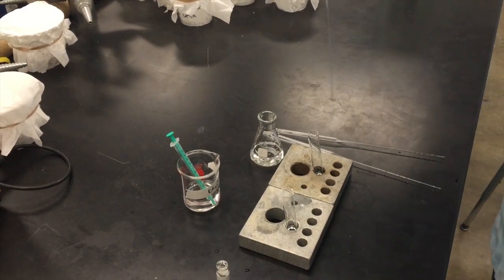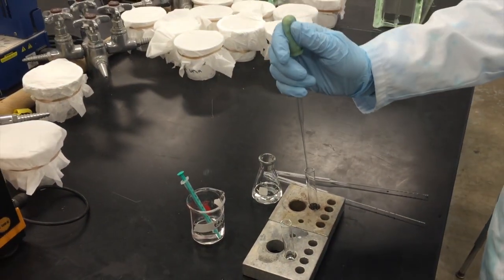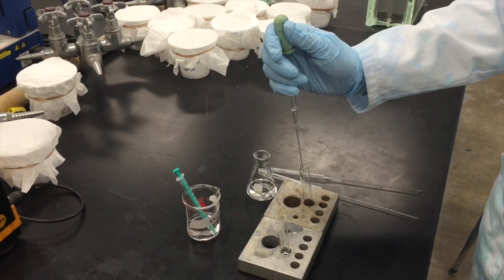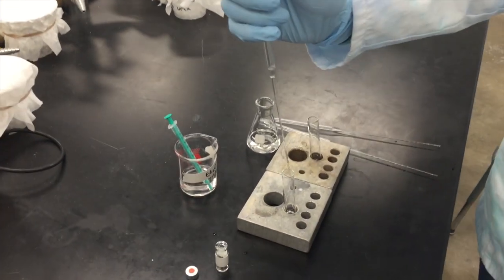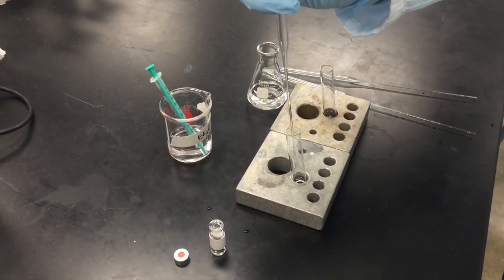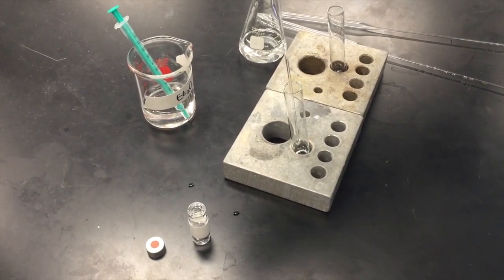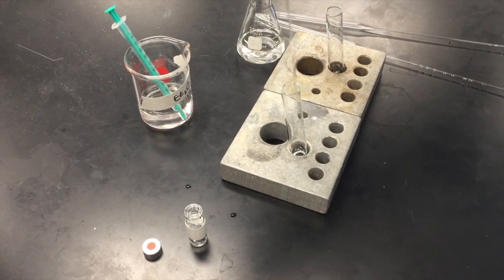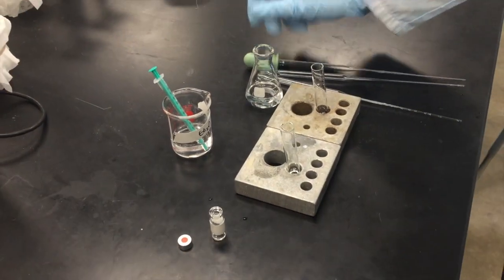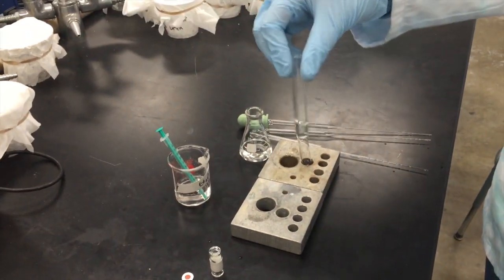Using a new pipette with an amber bulb attached, add three to five drops of the solution in test tube one to the second test tube. Swirl the test tube to mix.